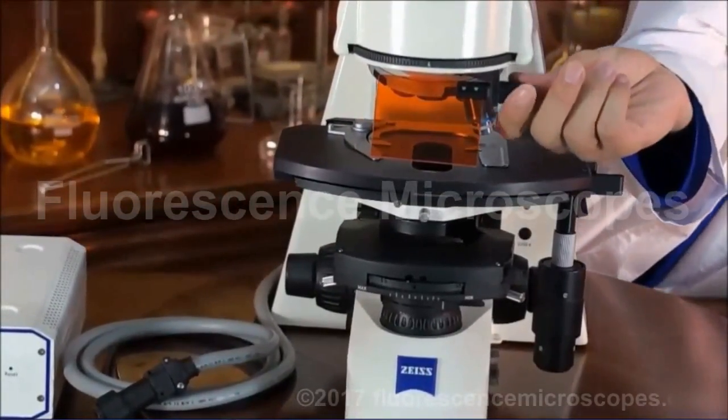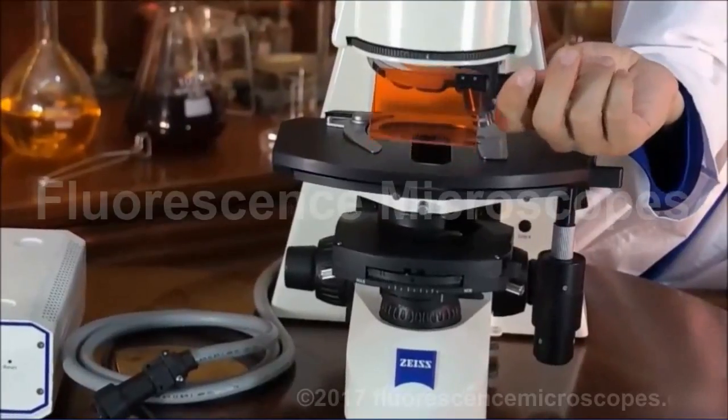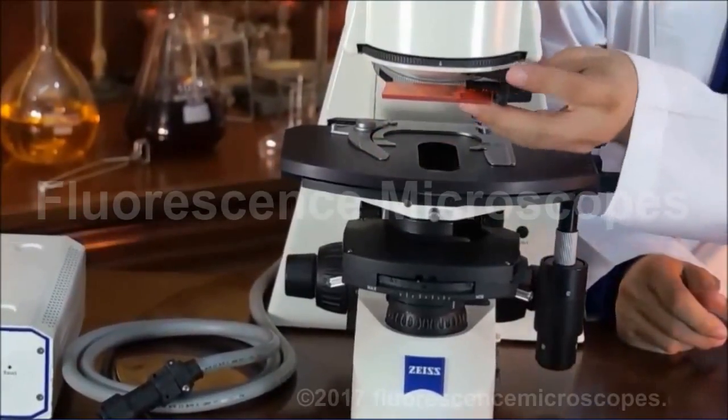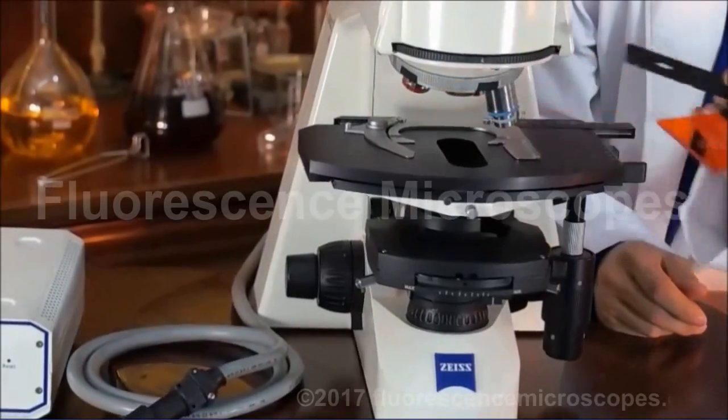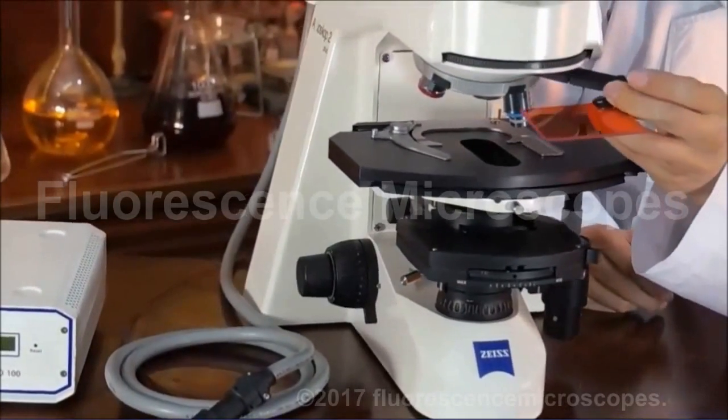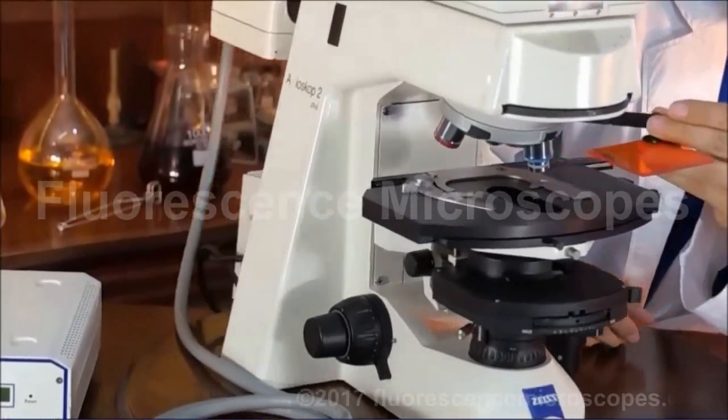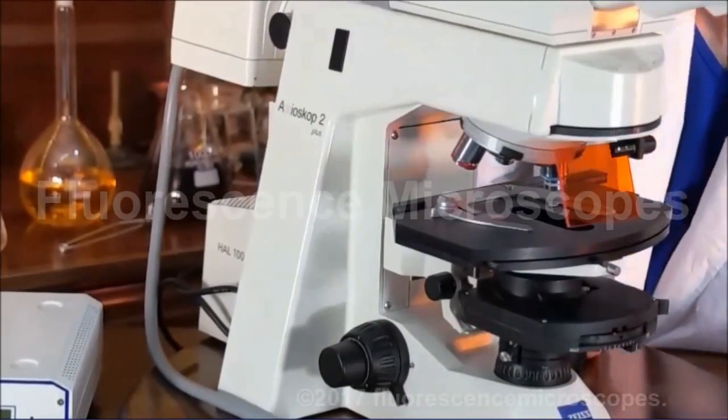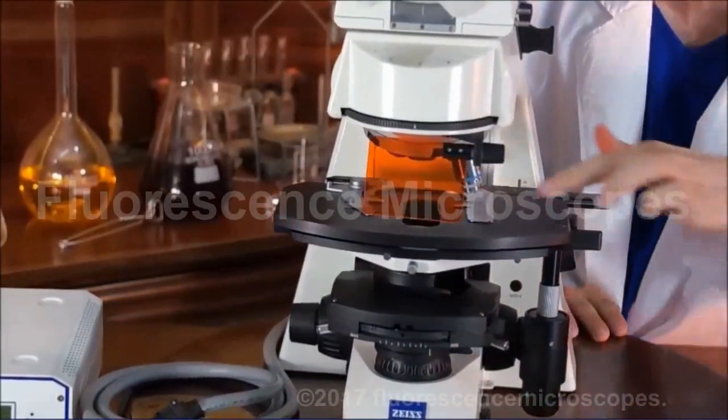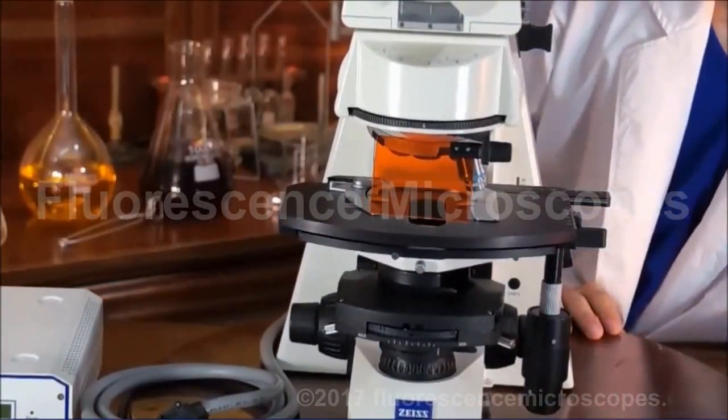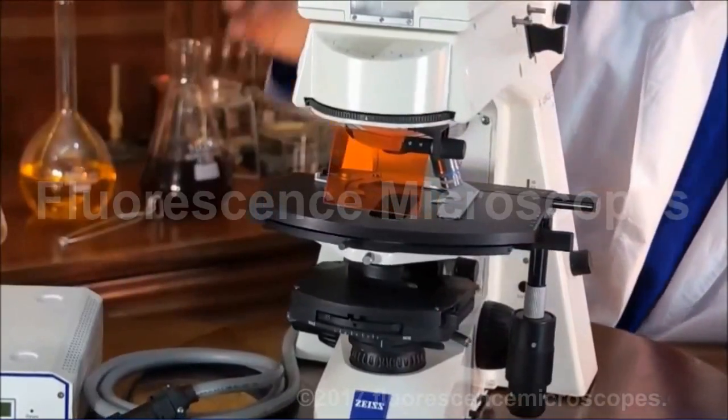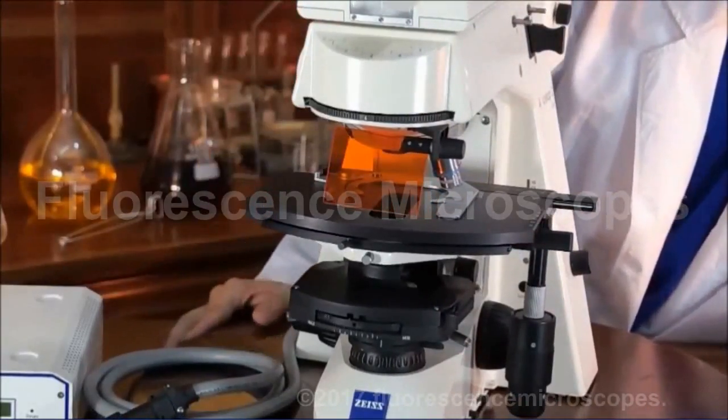We do have a nice UV protector filter shield on the front. You can also take this out if you don't like it. It's good to protect your eyes from extraneous reflected UV that may be hitting your specimen. When you're doing fluorescence, it's only a concern for fluorescence.